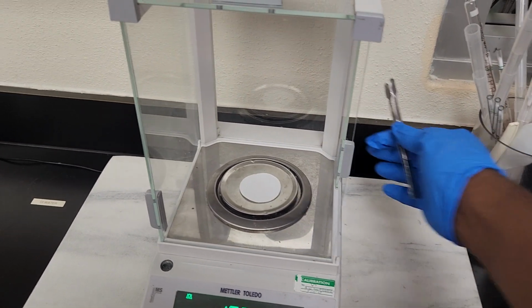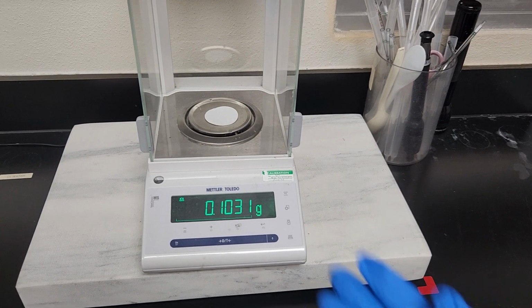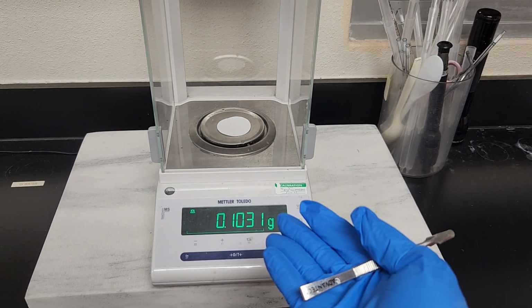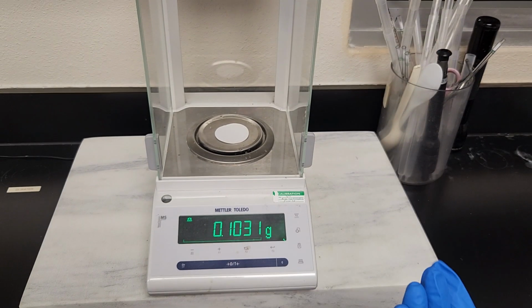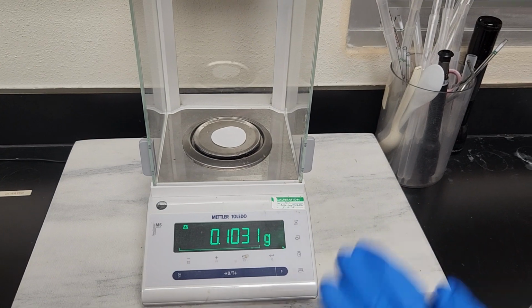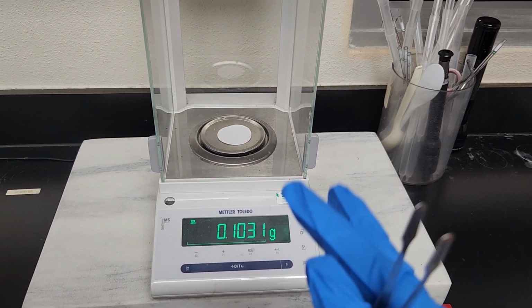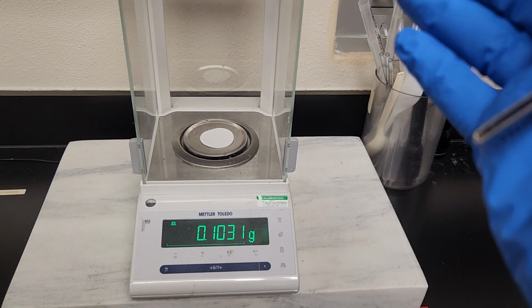I'll bring it to the scale. Now this is the weight with sample, so we're going to subtract the weight without sample from this, and that will be the TSS in milligrams per liter. So this is a general idea of how you conduct or investigate the TSS of a sample.